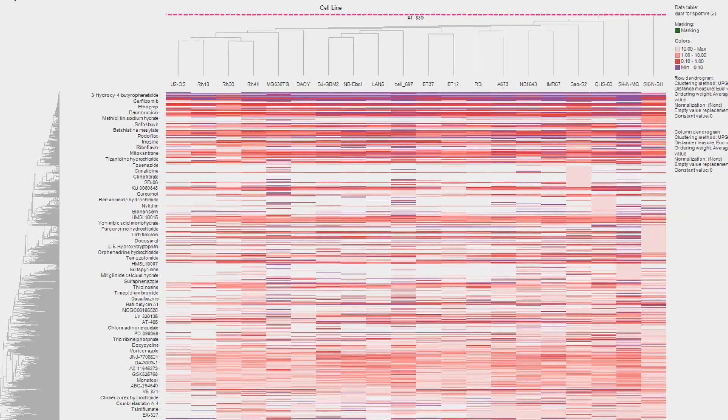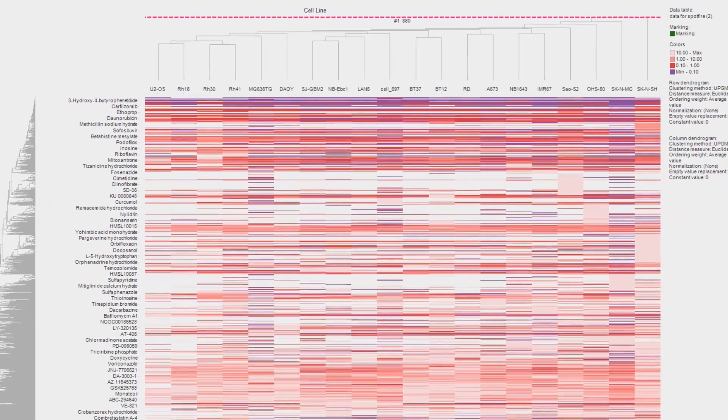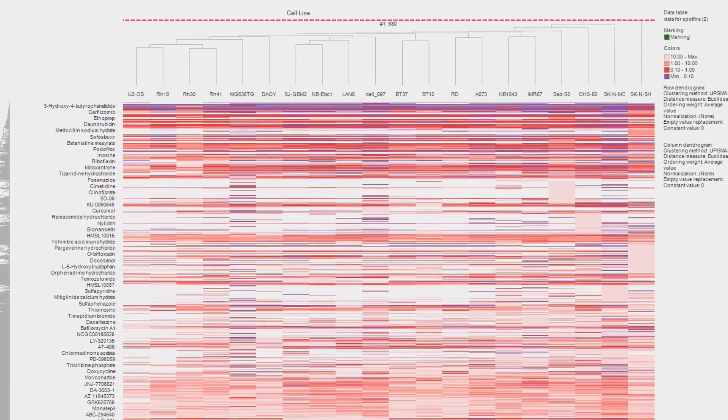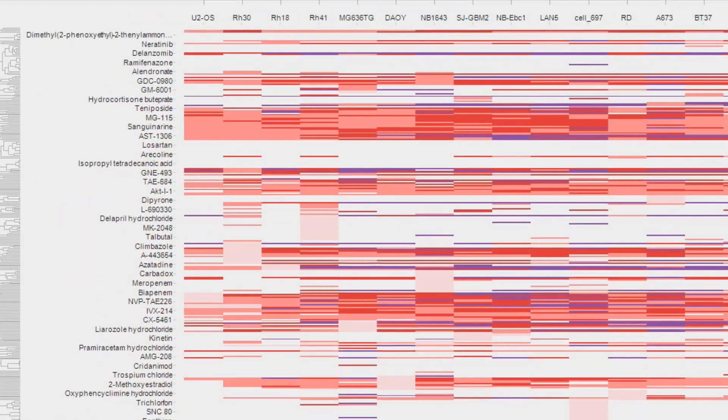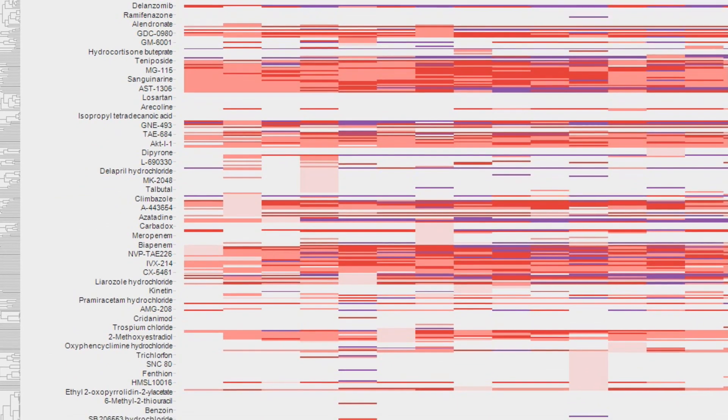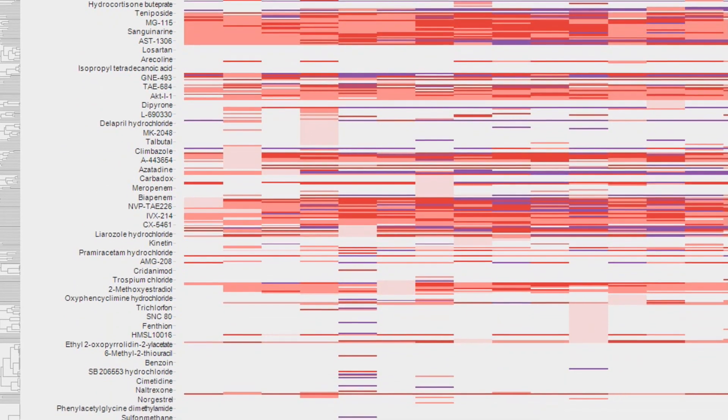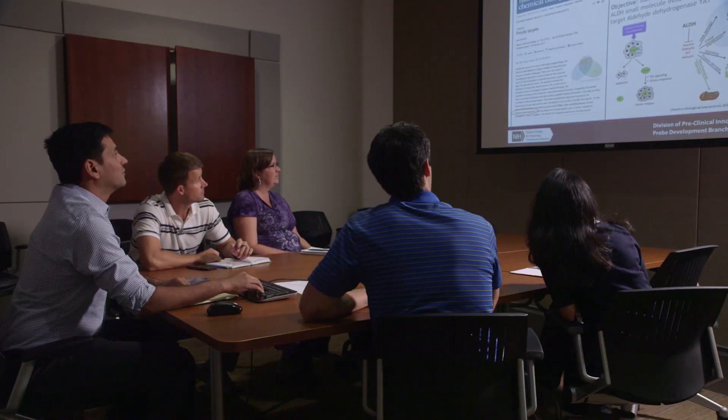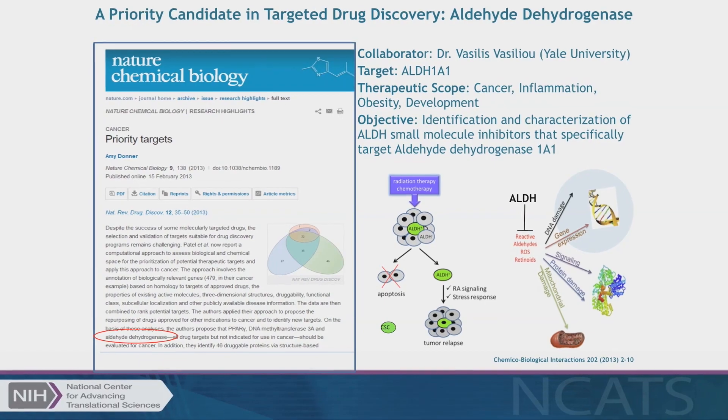The information from the robot plate reader is converted into numerical data, and NCATS informatics and computational researchers analyze the results from the robotic screen to identify the compounds that showed activity. The informatics researchers and biologists then work with NCATS medicinal chemists to determine the most promising compounds to work on.